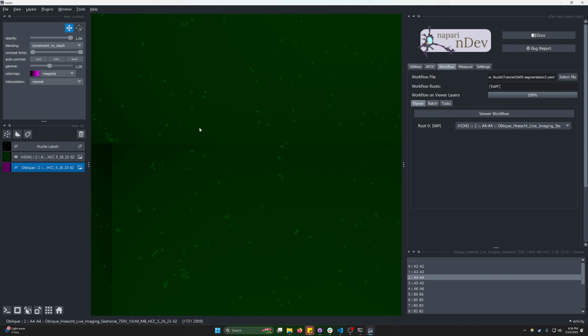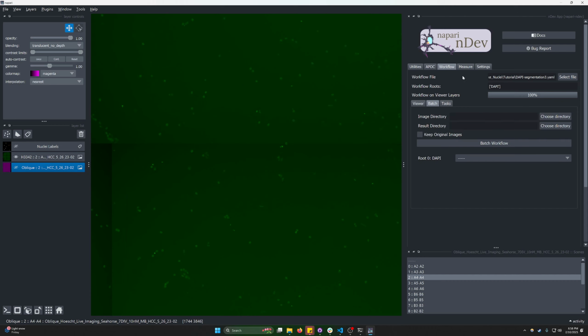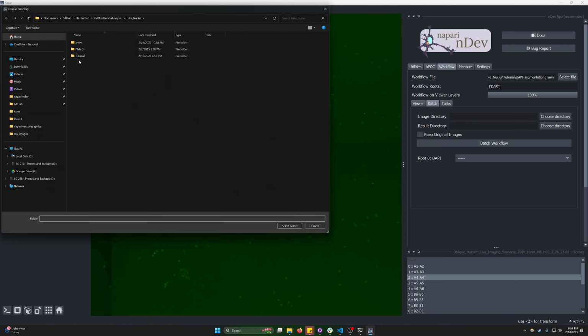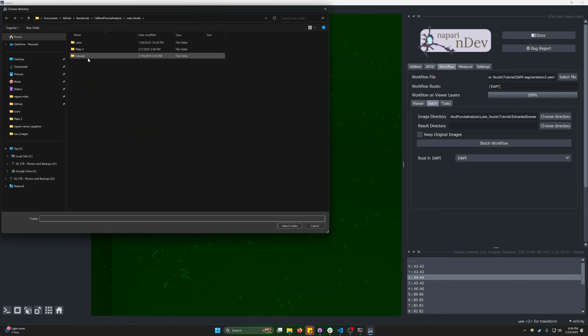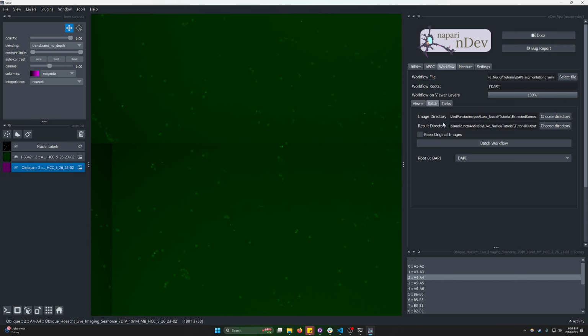So we can interact with it from the viewer, but we actually want to do Luke's project. In order to do that, we're going to go to image directory, tutorial, and I'm just going to pick the folder with all the extracted scenes. In here are the channels that are in those images, and we're going to make a results directory for this. I'm just going to call this tutorial output. I'm going to select this folder. I'm not going to keep the original images, and this is going to run through everything.